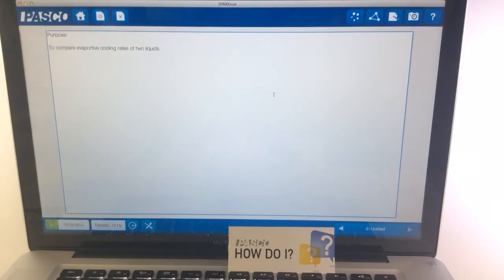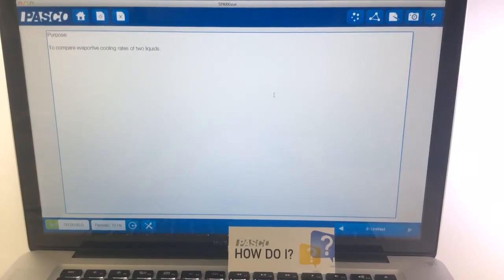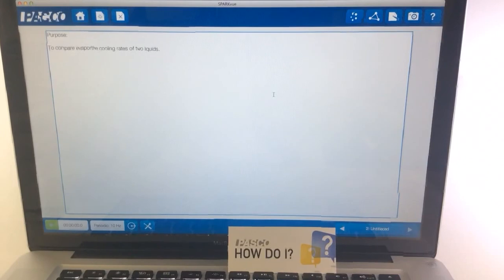So that would be one way that students can create a lab report that they can share with their teachers.